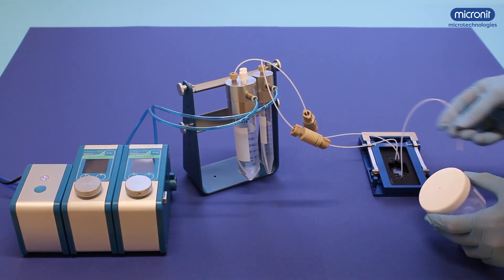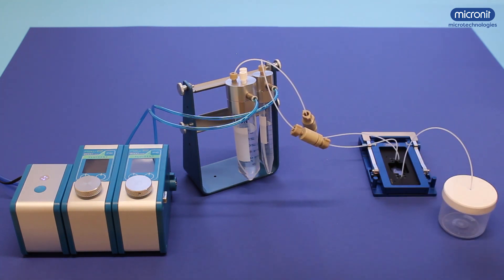All that is left is to connect the outlet tubing to the place you want the finished droplets to go. Now the setup is completely assembled. It's time to turn it on.